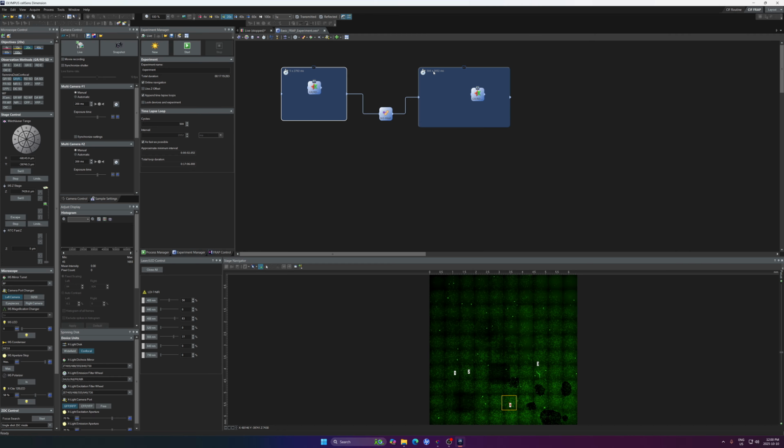And then I want to do the afterward. I may not want to do this 500 millionth frame. I will just do 20 just for our own sake. And again, as fast as possible, or you can just tell whatever interval you like to do. Maybe every 2 seconds or 3 seconds. By default, the minimum value input, you cannot do less than 2.03 seconds. So that will tell us we need to do 20 and 3, that would be a minute.